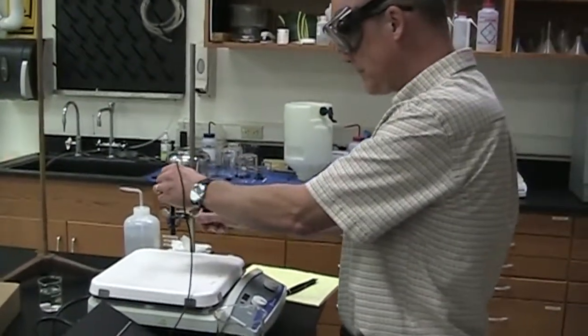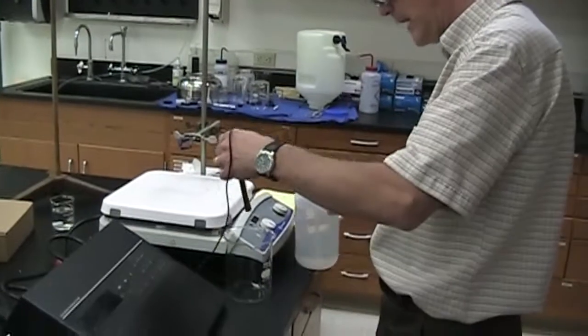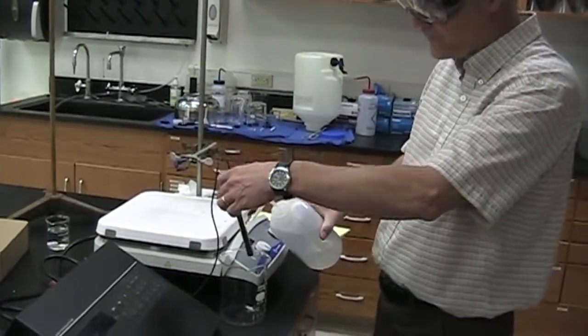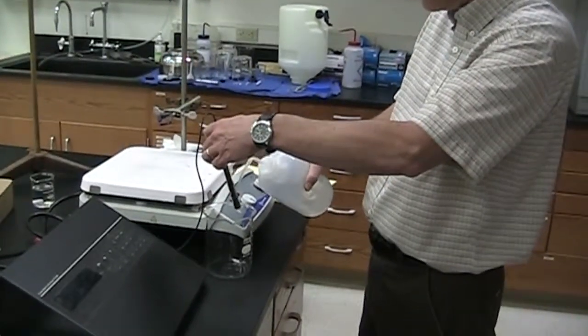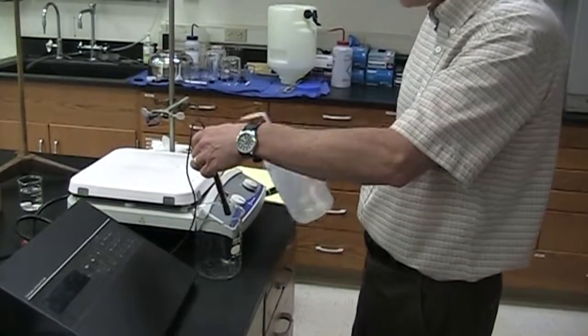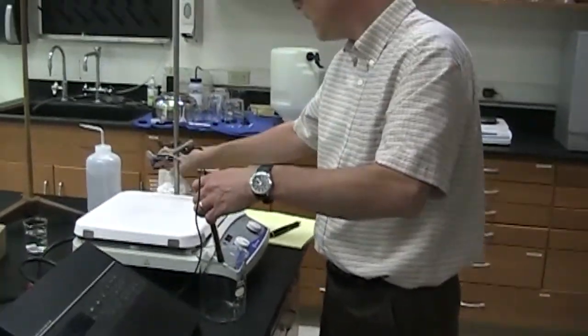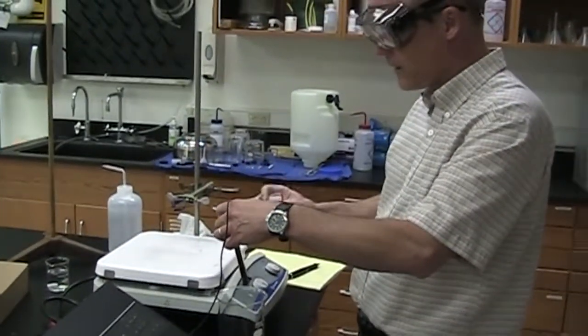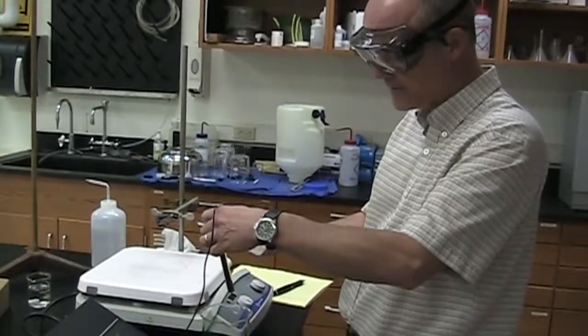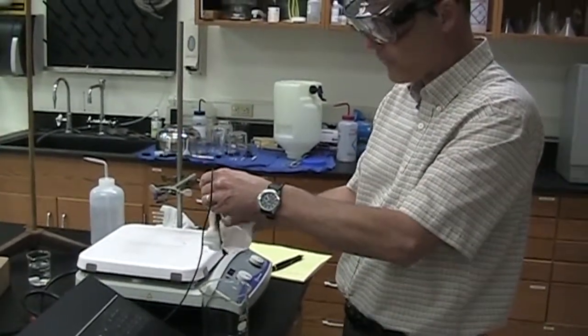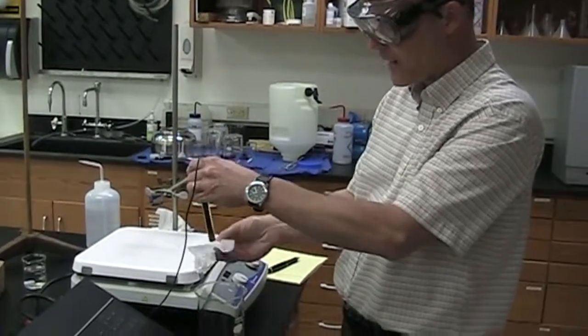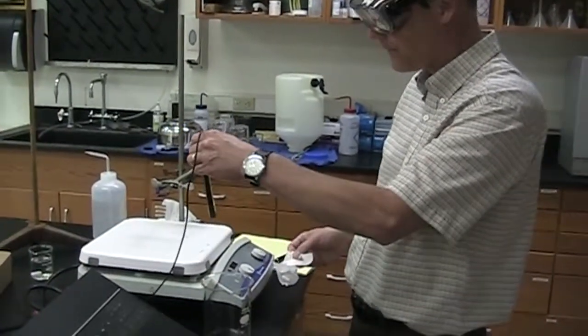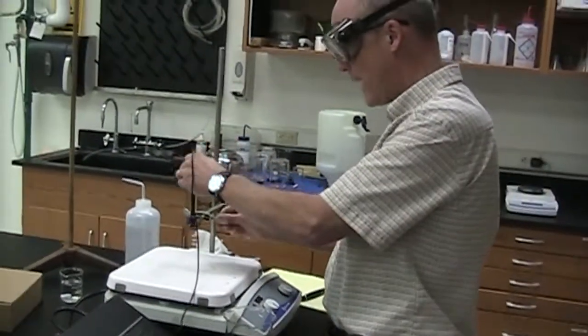We will then rinse the electrode if you're near a sink, over a beaker, however you choose to, with distilled water. We simply squirt some on there. And then we don't rub the electrode at the sensing element, which is the bottom. We can kind of wipe the water off. And then for the bottom, we just dab it lightly. Goes back in the holder.